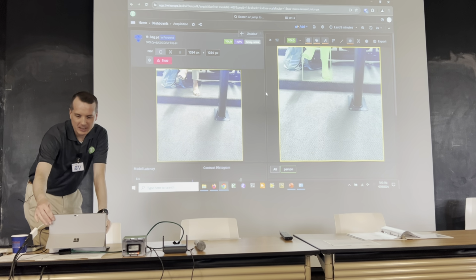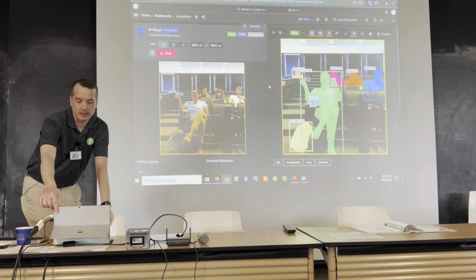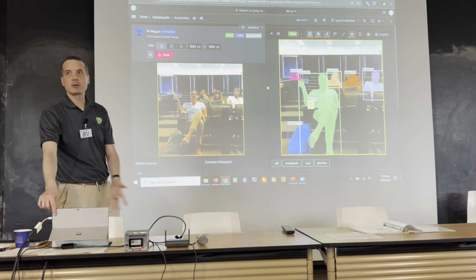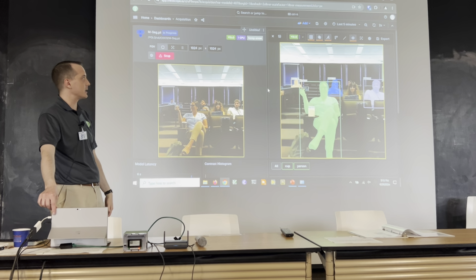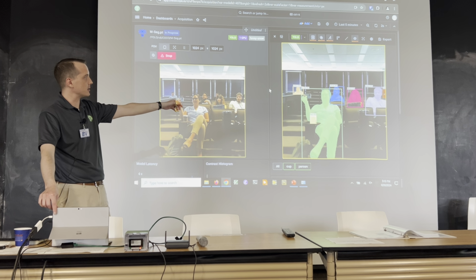We are running our model on everything in there. So we're doing the instance segmentation. You can imagine, I don't have an electron microscope here with me, so I can't show this in real time. So we use this as a demo anyways, but your scores are in there. I know it's a little fuzzy, but we're also picking up the cup.